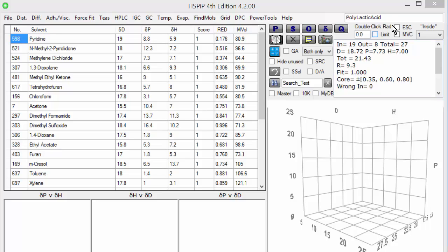The example here involves polylactic acid and the data set that I have here is from the open academic literature. What happens is that someone takes some test tubes, in this case 27 of them, puts in a small amount of the polymer into the tube, and then adds a different solvent to each tube.